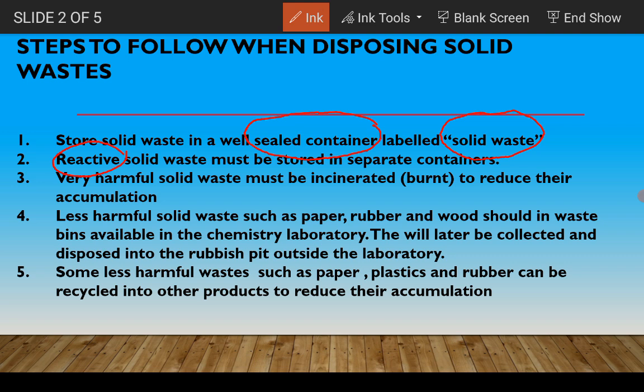So reactive solid wastes must be stored in separate containers. They should not be mixed with other chemicals. For example, if you mix them with water, there is going to be a violent chemical reaction.